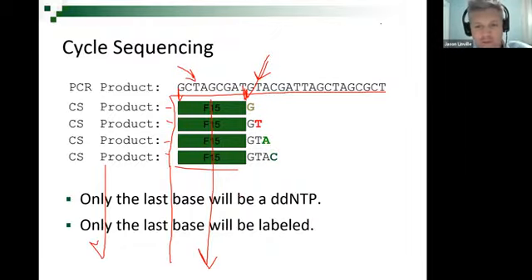This just shows 4 things that can happen. Okay, in this first one here, the polymerase right off the bat grabs a special G, and adds that special G, it stops. Okay, this is not getting any longer. At the end of this cycle, this is what it's going to look like. Okay, for this F15, the polymerase adds a regular G and then keeps adding, oh, the second letter it got is special, a T. So this stops.